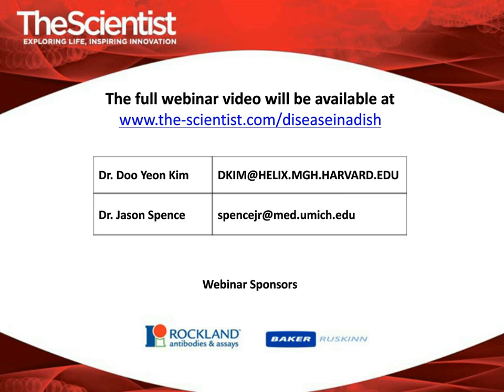I can start first. This is Yeon Kim, and this 3D culture matrix was quite reproducible. It doesn't require those robust, highly complicated structures. So the culture models we've been watching are very consistent in time, and different cell lines actually have different traits. But in the same cell line, we have very similar timing of the A beta aggregation, and we see the tau pathologies. So it's quite reproducible in our hands.